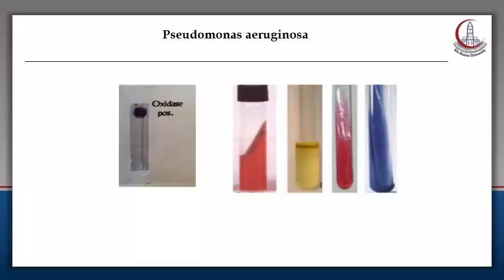If it turns purple, the test is positive, and the characteristic of Pseudomonas aeruginosa is that it is oxidase positive.